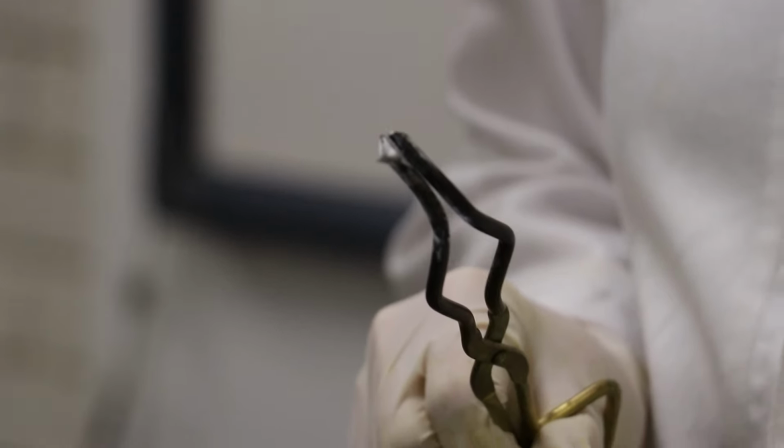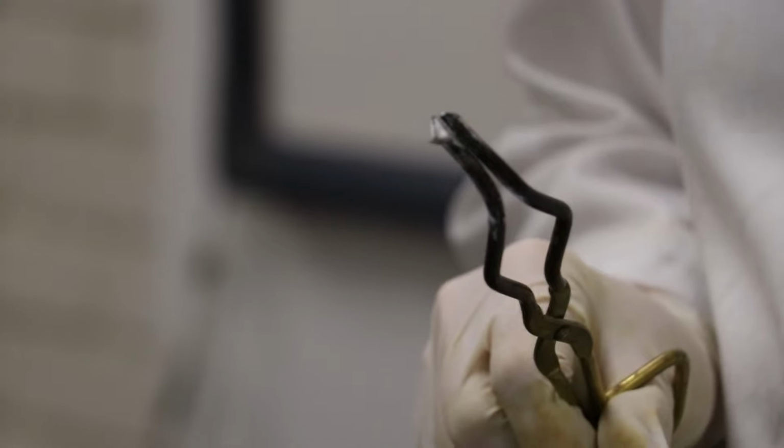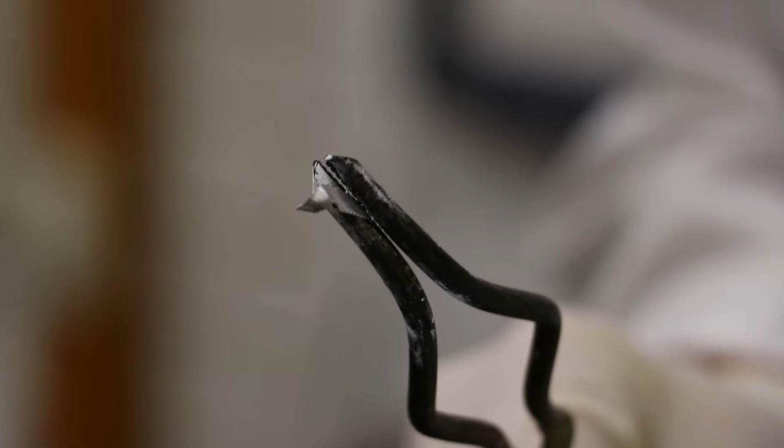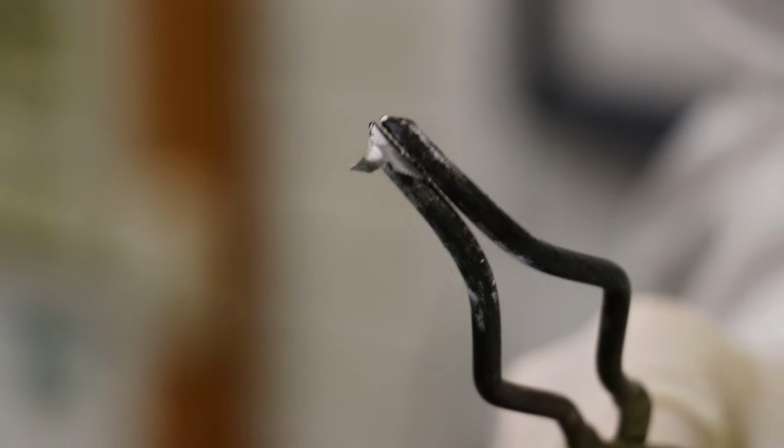Do you see the bit that's been in the Bunsen burner flame? Do you see how it's not shiny anymore? Now it has a coating of aluminium oxide. This is an ionic compound and therefore isn't shiny.